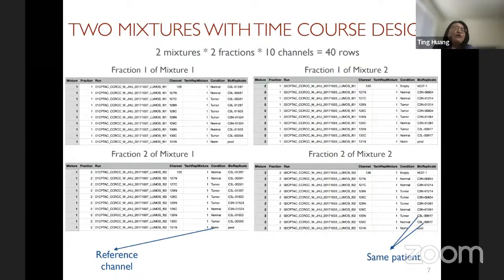Then the testing, the statistical inference function knows we will not use the empty channel for the statistical testing. So the empty keyword basically lets the user select which samples you don't want to go into the statistical inference. Those are the two keywords in the condition column.